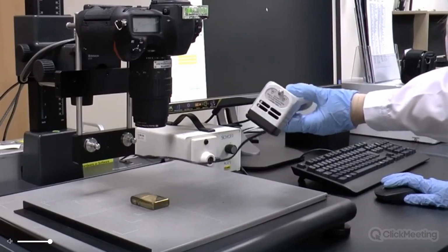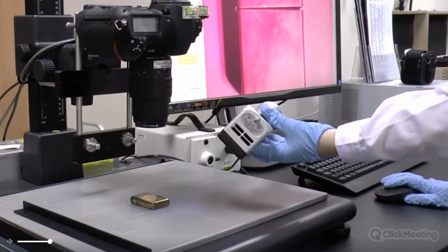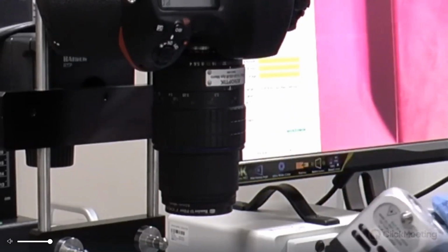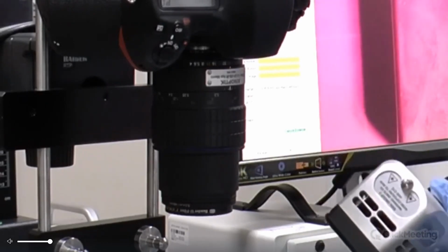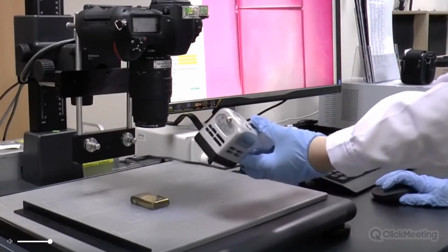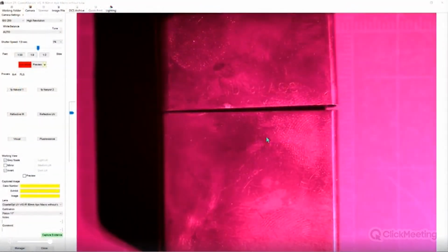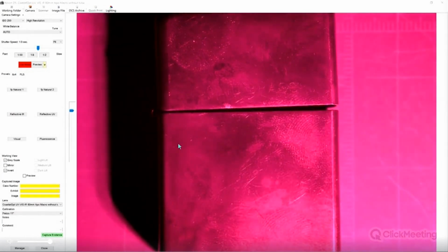For many of you who are already aware of this process, and for others who don't, what we simply use is a special quartz lens. We use a special bandpass filter on the end of the lens, and then we use an 82S crime light. What's really important about reflective UV is often the angle of light, and as we move around the evidence we can start to see a number of finger marks becoming illuminated.